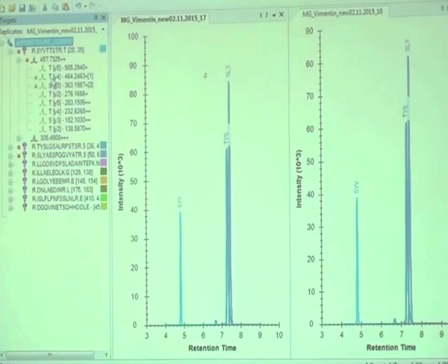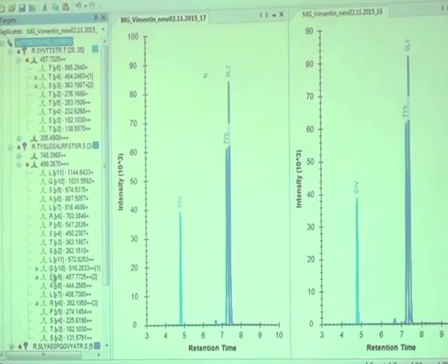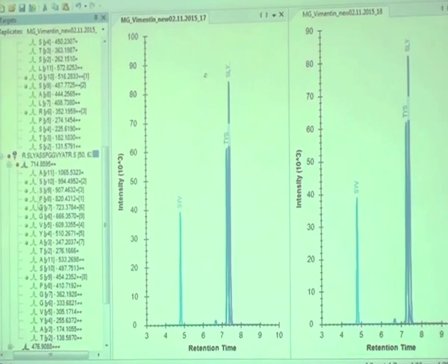So here only for these 2 transitions response is there, and here also for 3 transitions response is there. And in this case also there are many transitions for which response is generated.